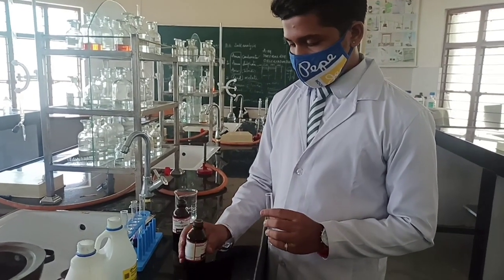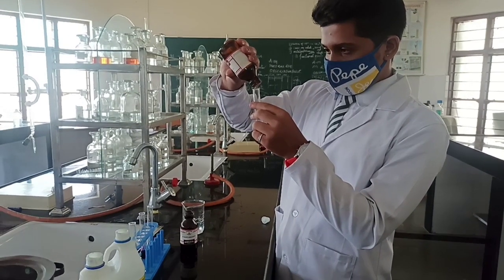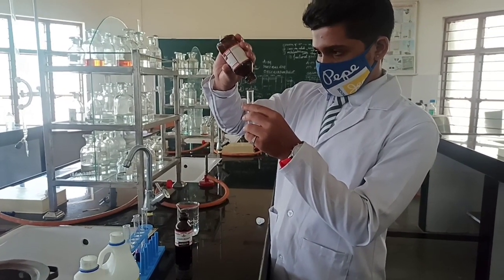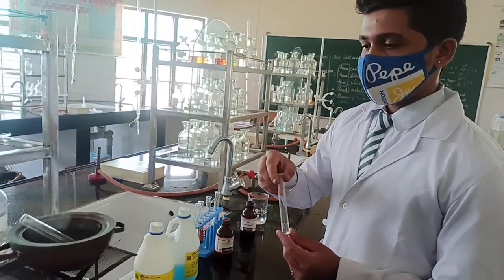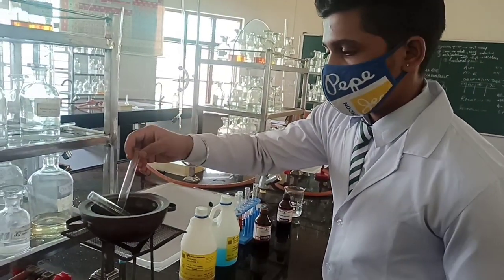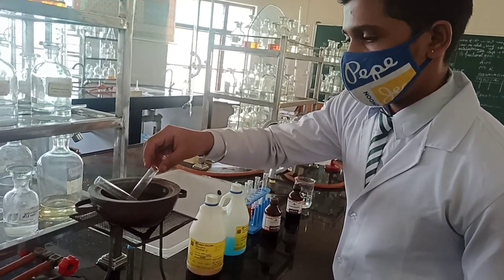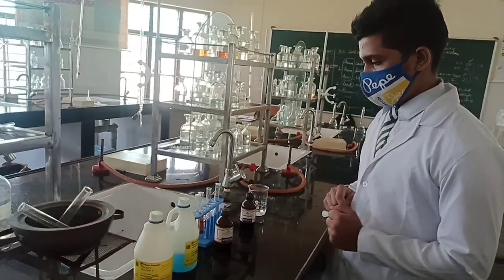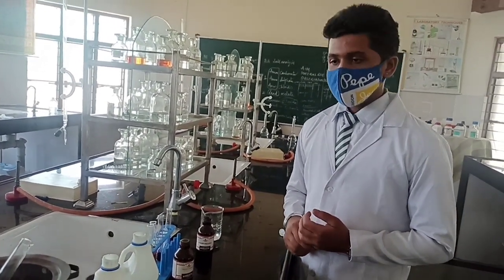Jayaditya will add Tollens reagent to the second test tube and keep it in the hot water bath for some time — around five minutes. Appearance of a silver mirror on the sides of the test tube will confirm the presence of aldehyde.